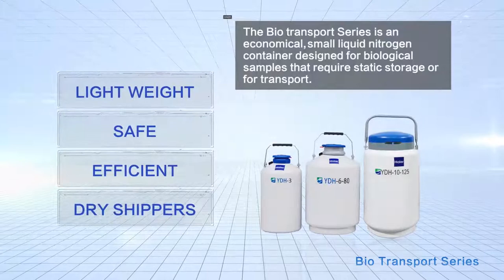HIAR aluminum alloy liquid nitrogen container — let every liquid nitrogen tank join the cloud era. HIAR Biomedical: Intelligent Protection of Life Science.